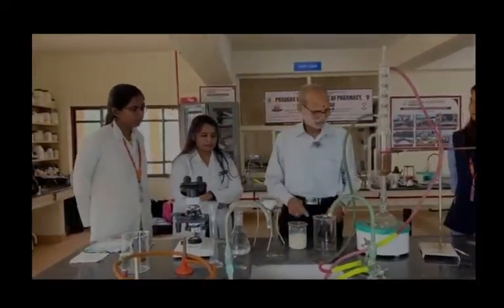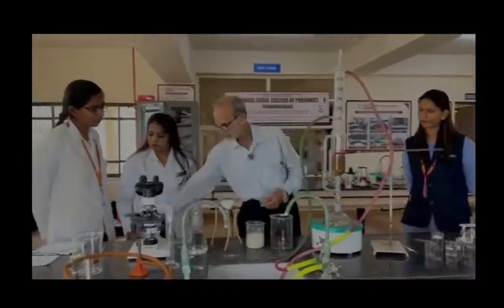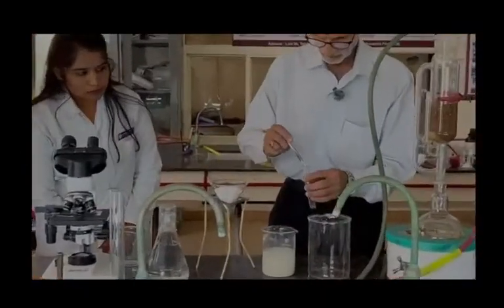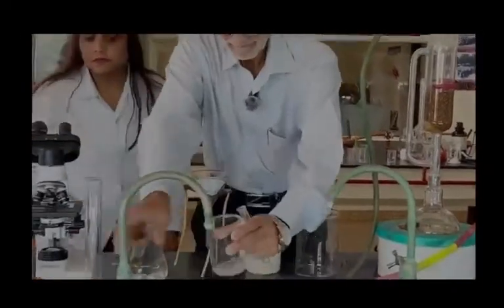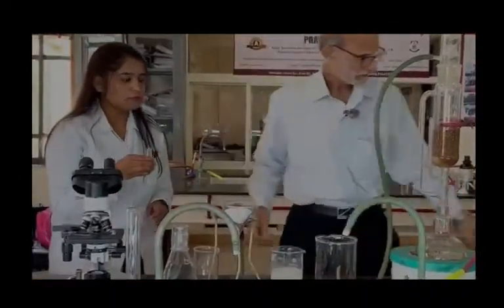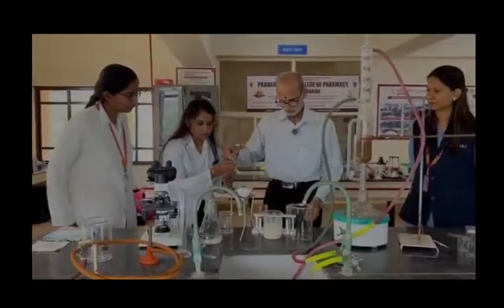In the meantime, we'll simply check with a test tube whether what we got is starch. Normally one should not do the drying with alcohol; industry does not do this. Industry first does the centrifugation and thereafter the flash drying. But in this particular case, since we wanted to check the starch, we filter that off, put iodine in the suspension, and see whether the color changes.